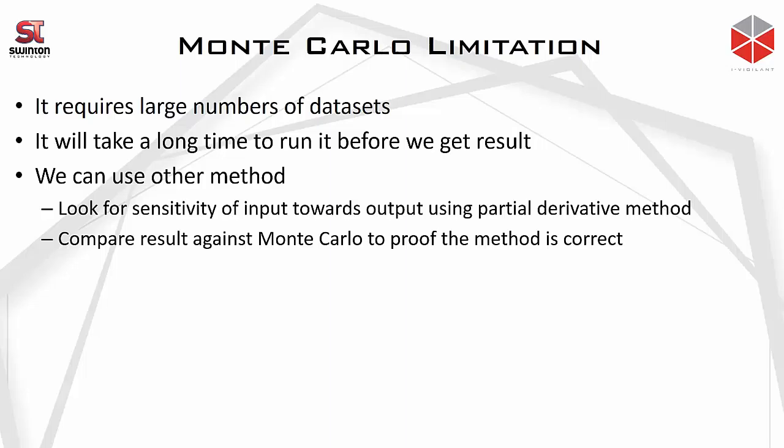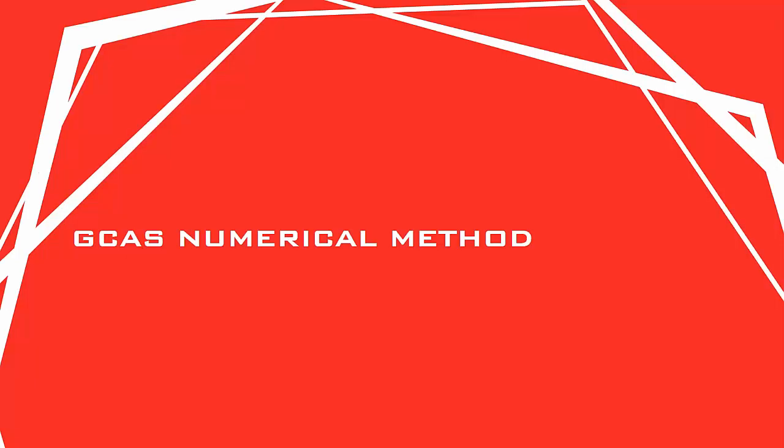What I'm going to show you here is what we call the GCAS method, and GCAS is our software tool to analyze the GC performance. Now I'm going to explain what the GCAS numerical method is all about.